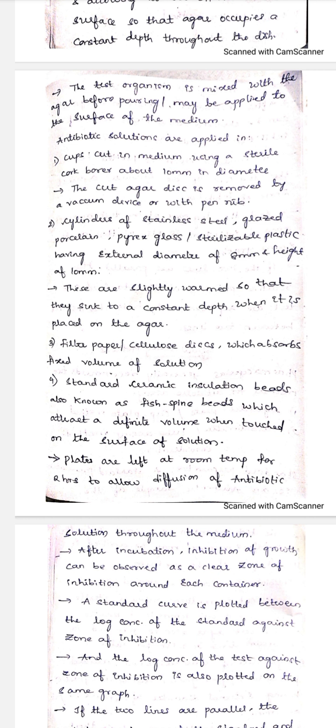After the agar solidifies in the petri plate, you can cut a small hole in the middle using a cork borer, in a disc, round or rectangular shape, whichever you want.